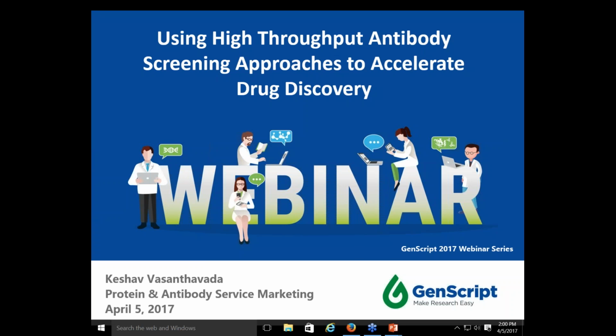I'm Keshav Vasantavara, your host and presenter, and I will be discussing the use of high throughput antibody screening approaches to accelerate the drug discovery process within the therapeutic antibody context.